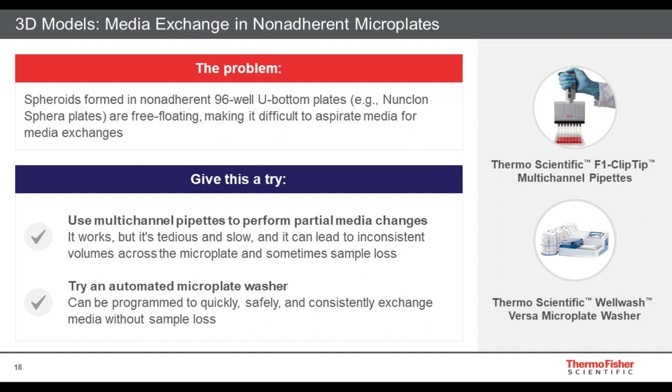And if you like, of course, it can add your media back, or if you want, you can do that part by hand, depending on the number of plates you have. It may or may not be needed, but it's certainly a much more efficient, fast, and in our hands has been a very reliable way of very quickly aspirating a fixed volume of cells across a number of 96-well plates, and with a level of consistency that we're just not able to do with multi-channel pipettes very easily.